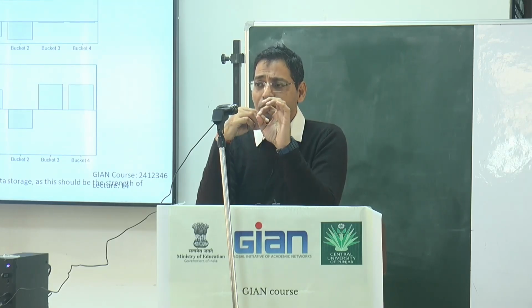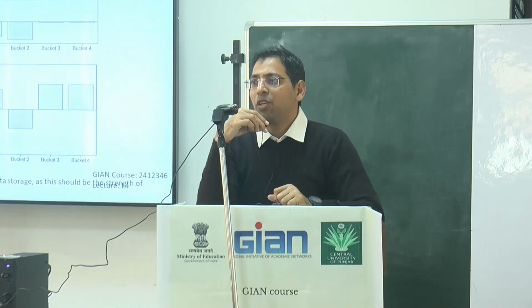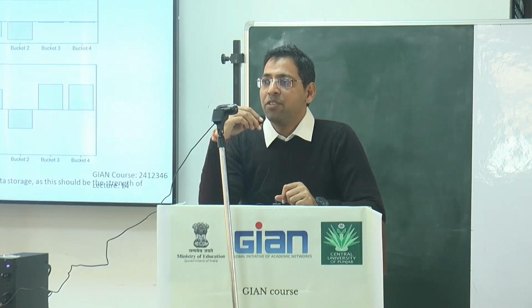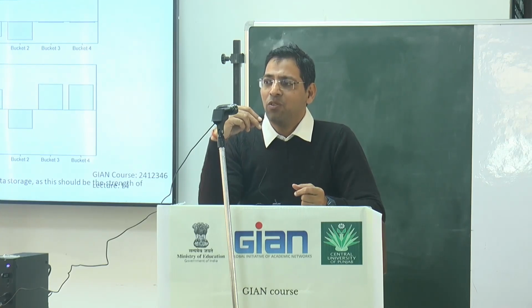So 59 and 60, even these two also give different types of values. I will explain those things in the tutorial in the class. I will take an example of the LCMS in which you find out that a single little change in the buffer can induce a whole change in the pattern. Then you understand the sensitivity of those things actually.